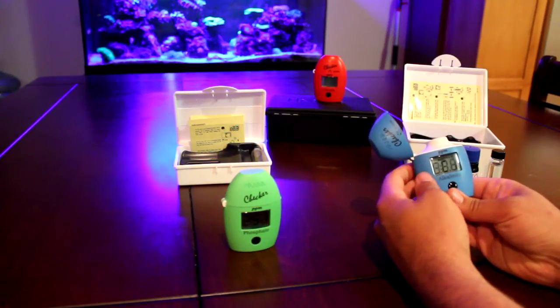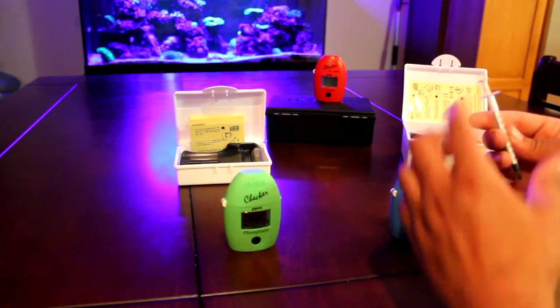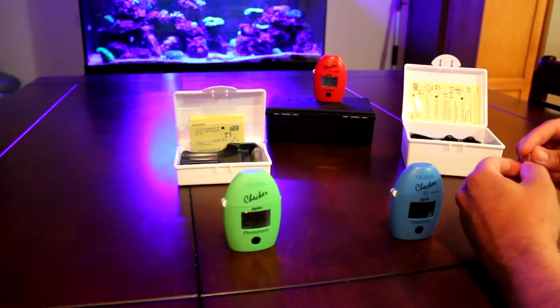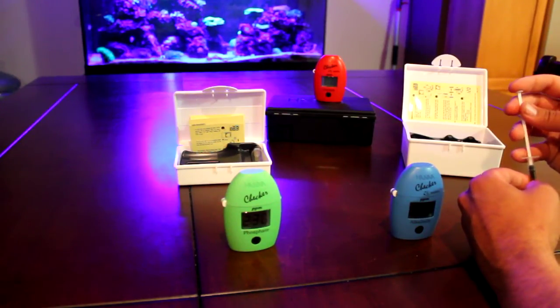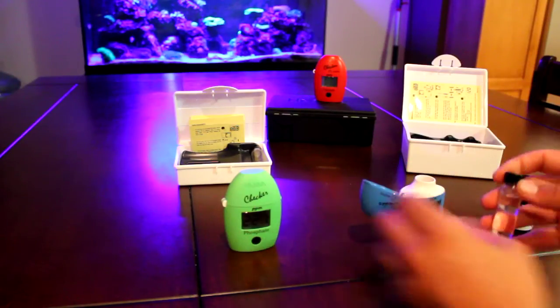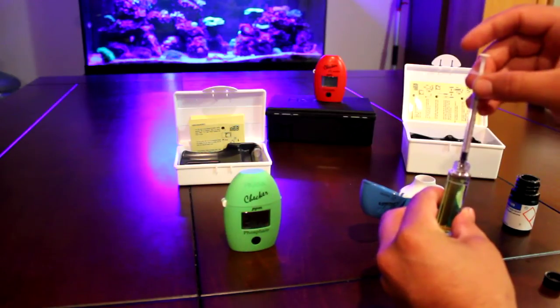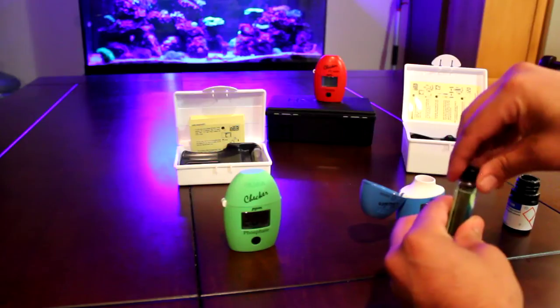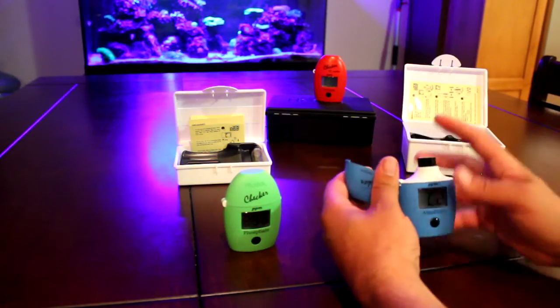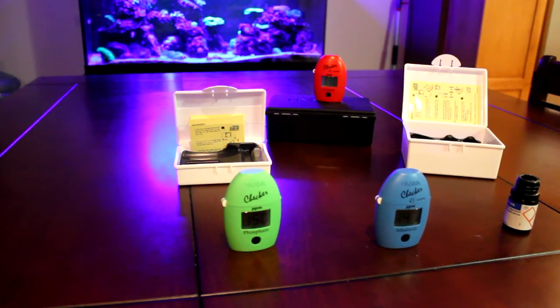Alkalinity - start her up. 10 ml tank water as well. Use the whole 1 ml syringe and add it right in. Mix that one up a little bit, and press. This one you're going to need a calculator if you want DKH because it shows you in parts per million.